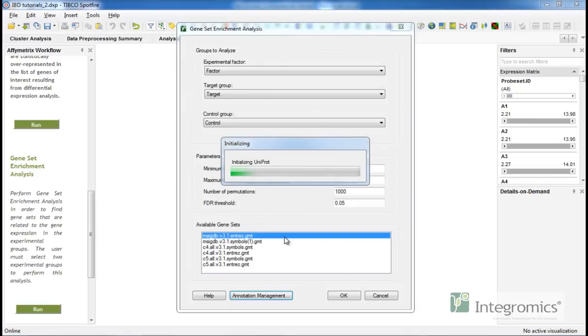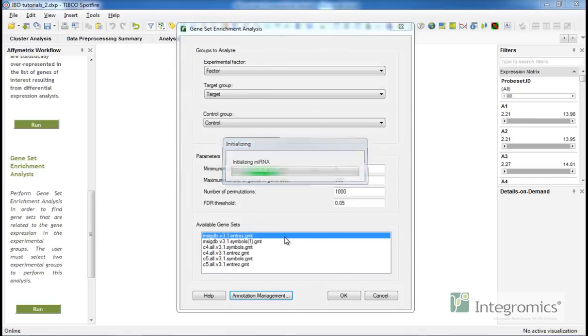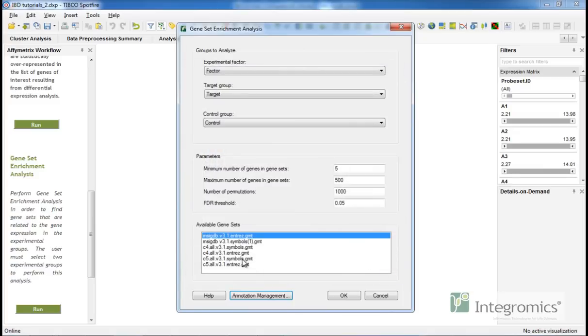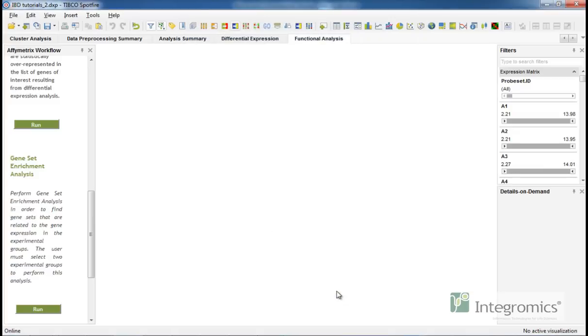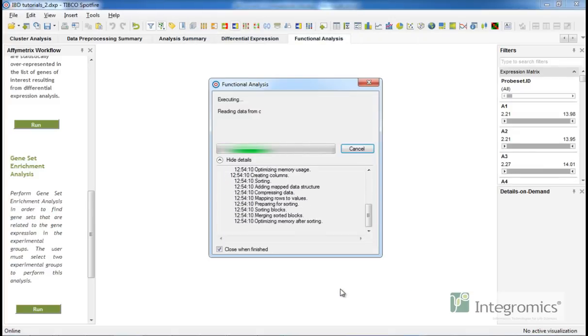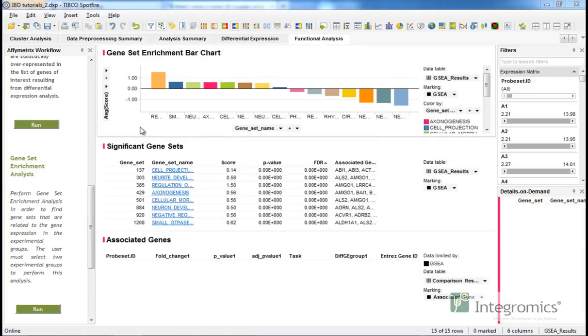To perform geneset enrichment analysis, please make sure that the array-specific annotations for the analyzed data are installed. Once you've defined your geneset of choice, please click Run to perform geneset enrichment analysis.